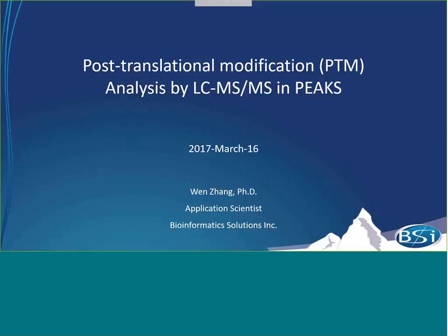Previously, my colleagues have introduced qualitative and quantitative proteome analysis in PEAKS. In addition, studies of post-translational modifications, or PTMs, via mass spectrometry also constitute a wide field of research and applications. Today, I will focus on PEAKS PTM analysis by liquid chromatography coupled to tandem mass spectrometry approaches.